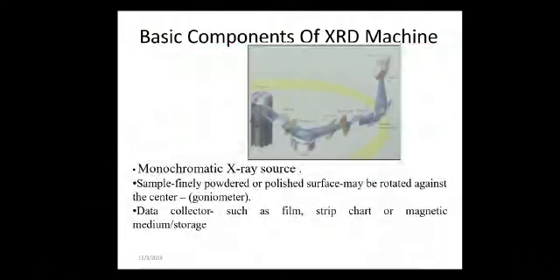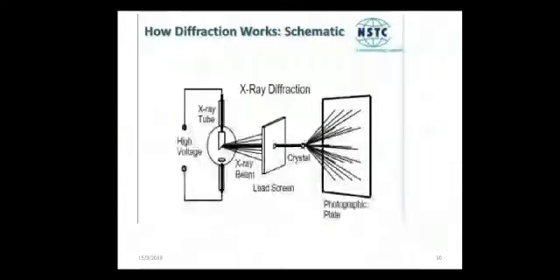So, instrumentation: how we are using this X-ray instrumentation. It consists of an X-ray tube. A high-velocity electron beam is targeted on the metal and X-rays are produced. Next to that, we can see the collimator, a closed metal plate, as you can observe in the diagram, separated by a gap which is used to produce the narrow beam.